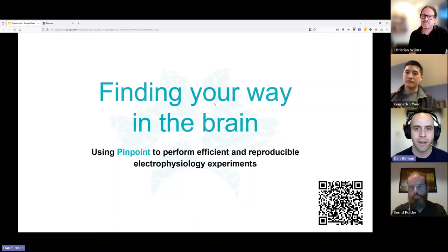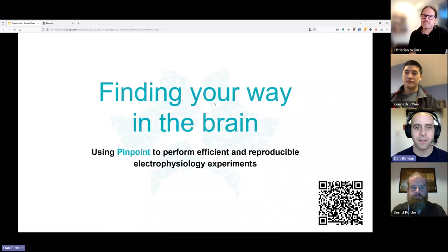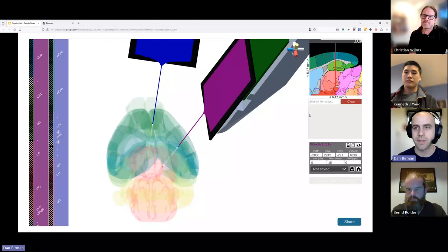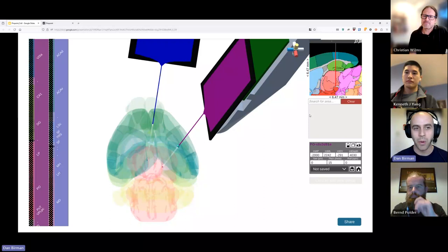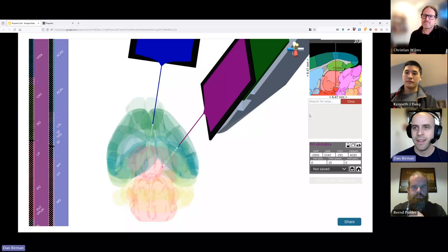Kenneth is going to show you the most exciting part of what we've been working on the last year, which is connecting Pinpoint directly with your micromanipulators so that you can see where you are inside the brain in real time. This is the Pinpoint interface, which you'll see in just a moment. I want to talk a little bit about what you're seeing and orient people if this is the first time you've ever encountered Pinpoint.